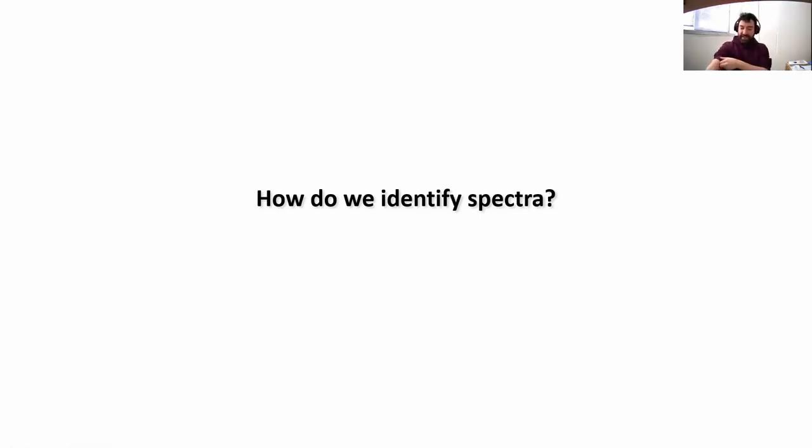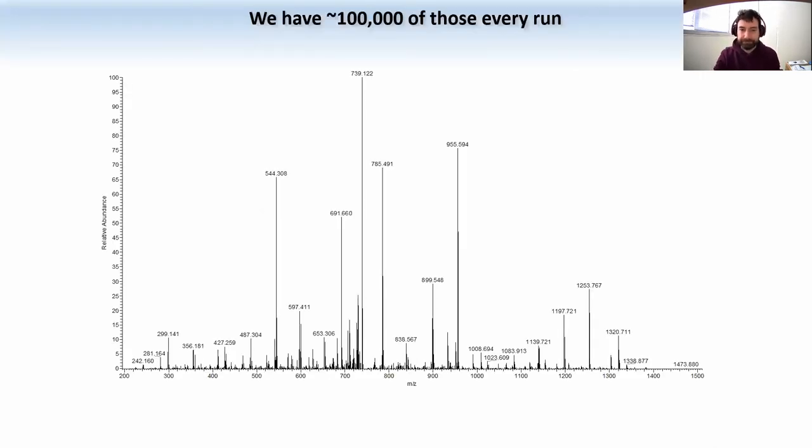Okay, so you saw in theory how we convert a spectrum into a peptide name. Now, I'm going to show you in practice what happens automatically by our software, how spectra are used to convert them into peptide lists and then eventually to protein lists. So this is an MSMS spectrum, right? This is what you have at the end of a run in mass spectrometry.